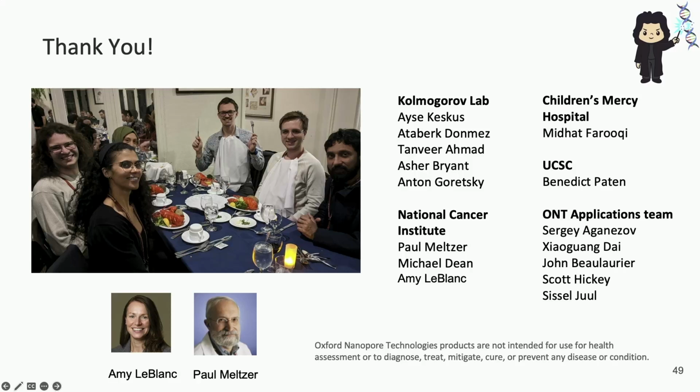And also there was an interesting highlight about a couple weeks ago. There was a study led by BC Cancer, and they analyzed a pan cancer cohort, about 200 patients, and all the tumor samples were from needle biopsies. So it's definitely possible to do it even without surgeries and without real biopsies. Of course, assuming you have maybe over 50% tumor purity and it's fresh.